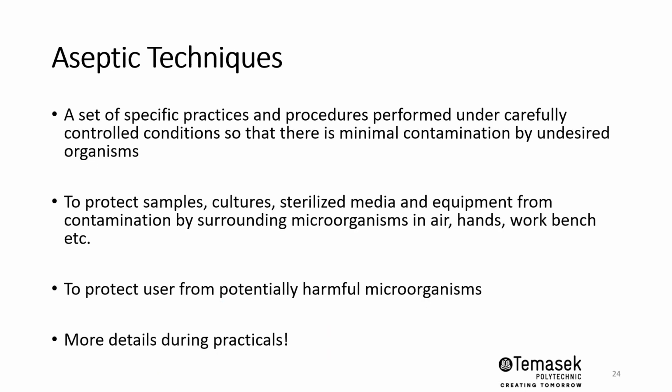I want to touch on aseptic techniques. You will come to learn about this in more detail during the practical, but aseptic technique is defined as a set of specific practices and procedures performed under a controlled environment so that there's minimum contamination by undesired organisms. So we want to minimize the risk of contamination by undesirable organisms apart from our microorganism of interest.